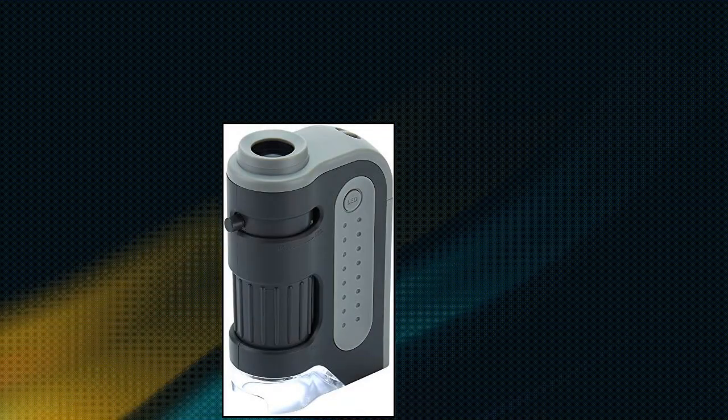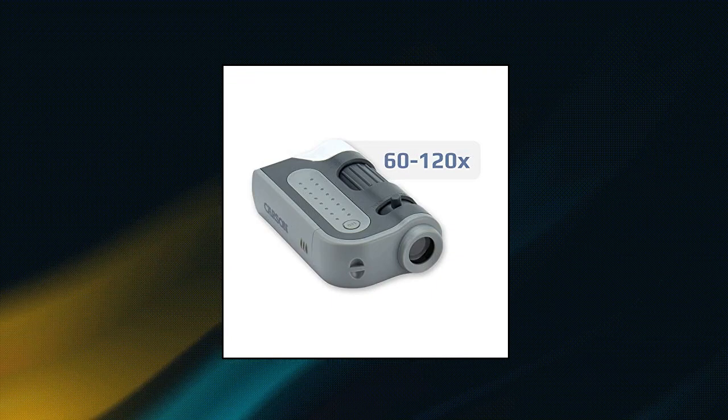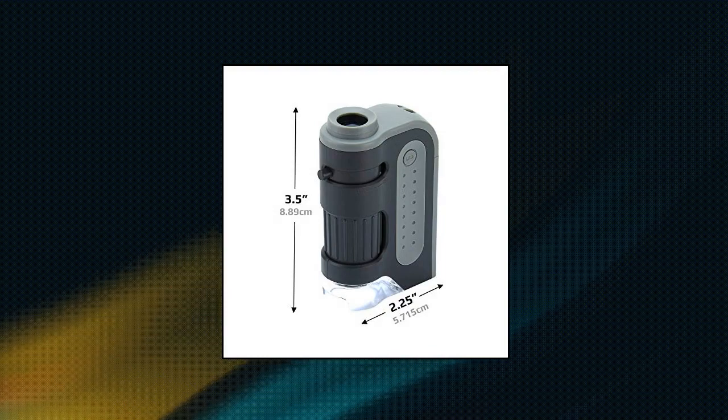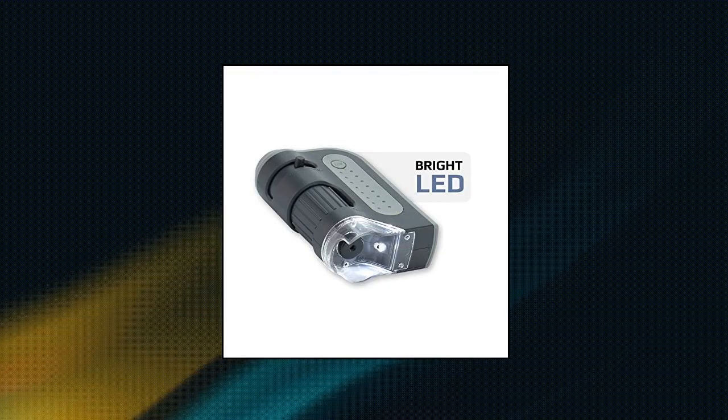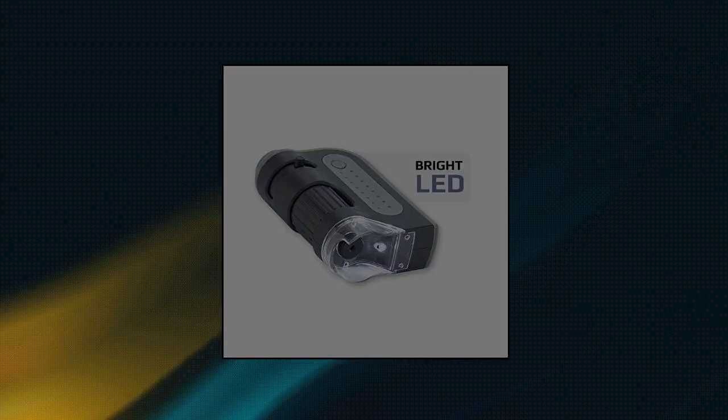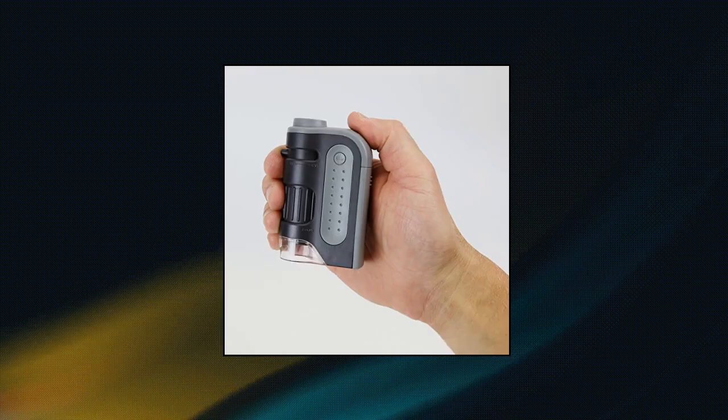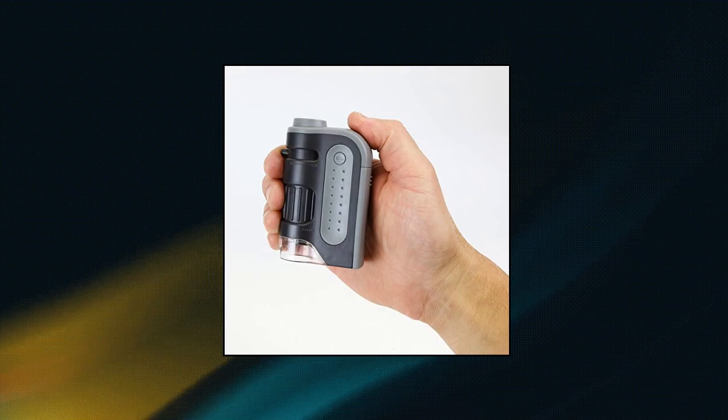Carson Micro Bright Plus 60x-120x LED Lighted Pocket Microscope MM-300. Pocket microscope with a powerful 60x-120x magnification range. Precision molded aspheric lenses provide superior optics. Designed to be compact, lightweight, and portable. Bright LED light is powered by one AA battery, not included.